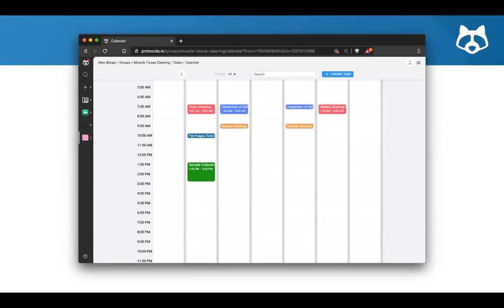And I know that in the lab setting, I've seen folks that just have a notebook with no colors associated with anything, but at the same time, I've seen folks with a lab notebook that has all different types of stickies and colors. And so what we're doing here is we're just bringing that ability to organize not only your data, but also schedule to a digital area. So these are my tasks for the week.